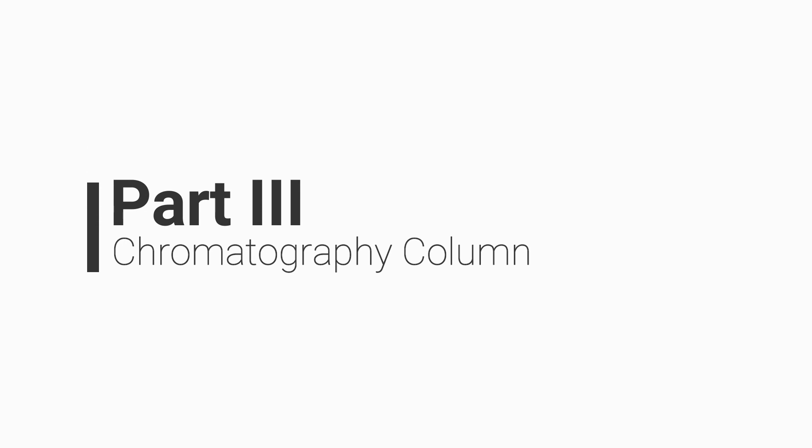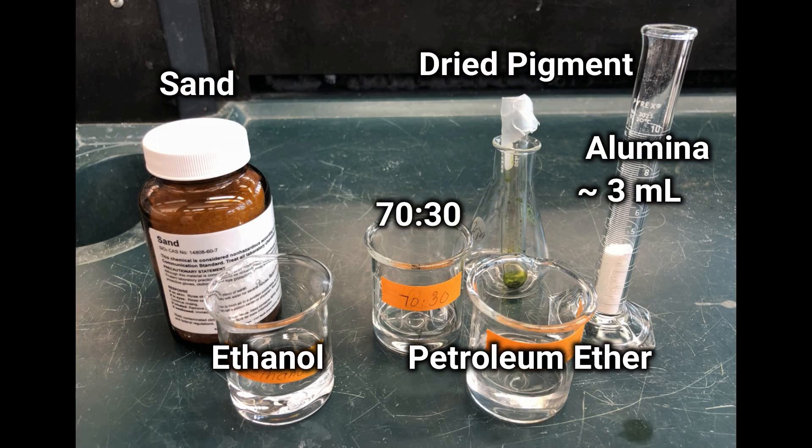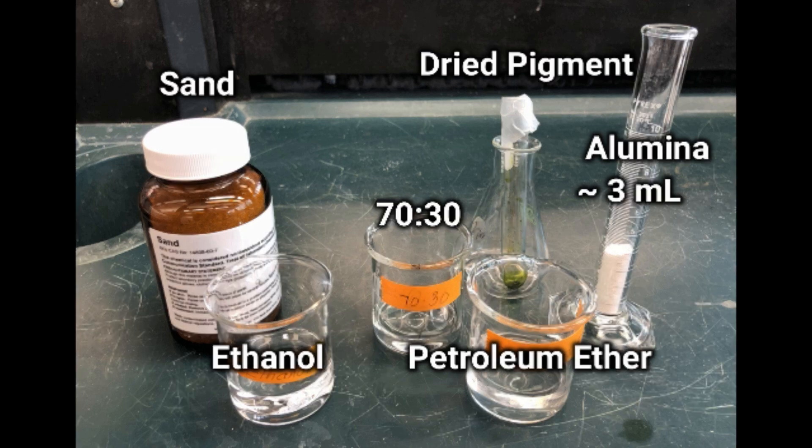In part 3, we will be separating the pigments using column chromatography. You will need sand, about 5 milliliters each of ethanol, petroleum ether, 70-30 petroleum ether, and about 3 milliliters alumina as well as the dried pigment from part 2.